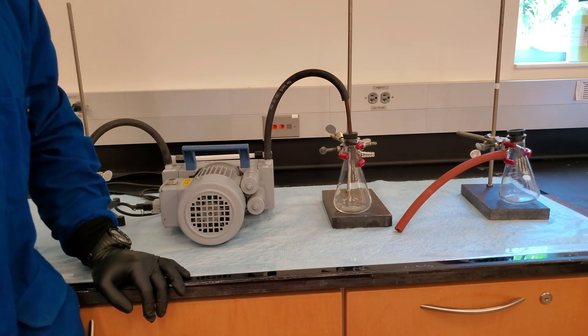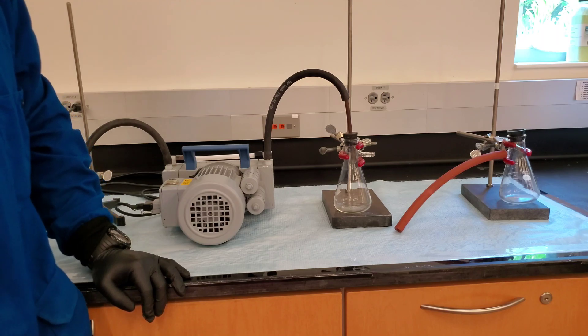Disconnect the vacuum hoses from the trap and empty the contents of the trap into a waste container.